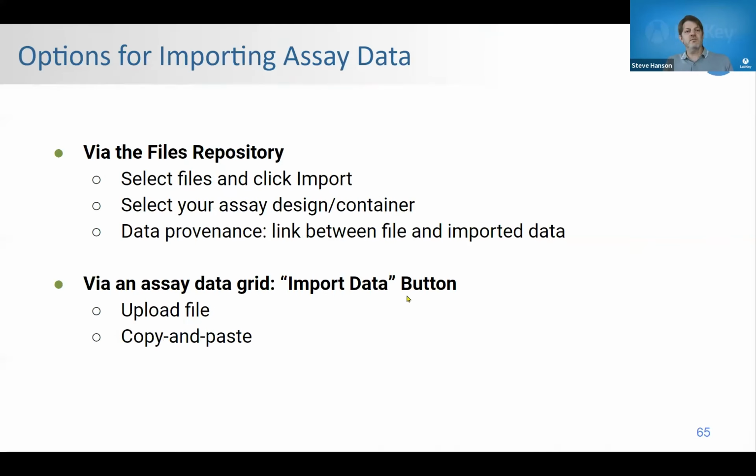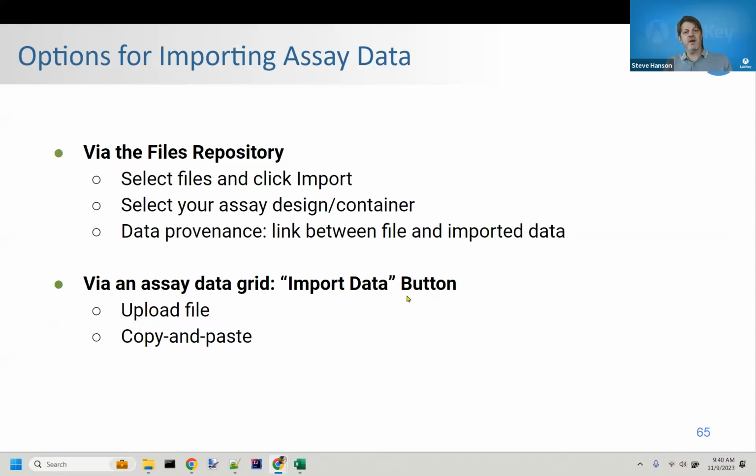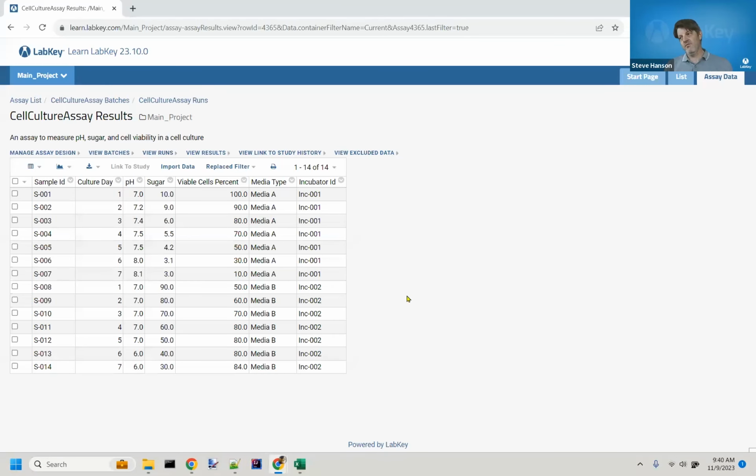Instead, I wanted to show you some other really interesting things about the assay framework. This is one of the things the assay framework does: it is aware and it imports in the background the files that I used, the Excel files. So the Excel files are actually back here. You just don't see them. Well, let's go see them. This is one of the great advantages of LabKey, and it's not often appreciated.